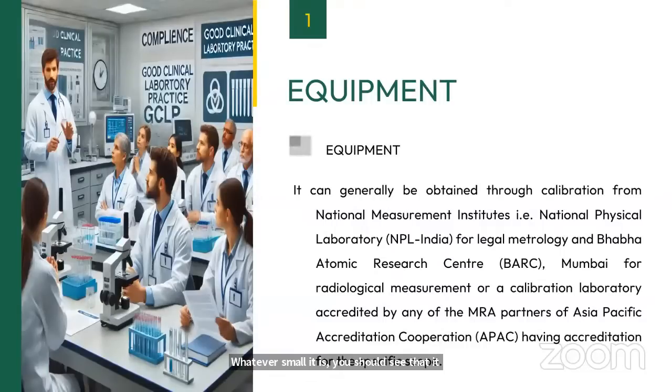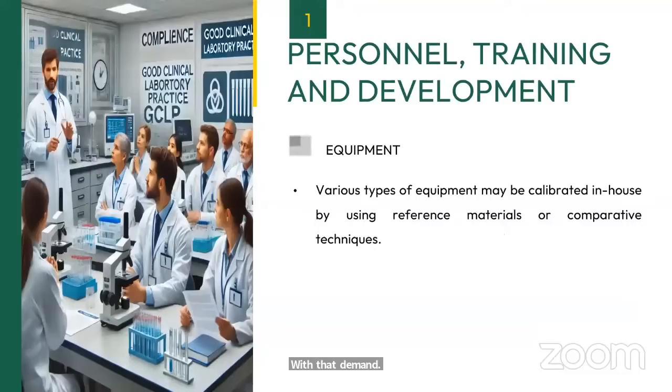And which accredited laboratory? One which is the MRA partner for APAC. APAC is the Asia Pacific Accreditation Cooperation. Various types of equipment may be calibrated in-house by using reference material or comparative techniques.